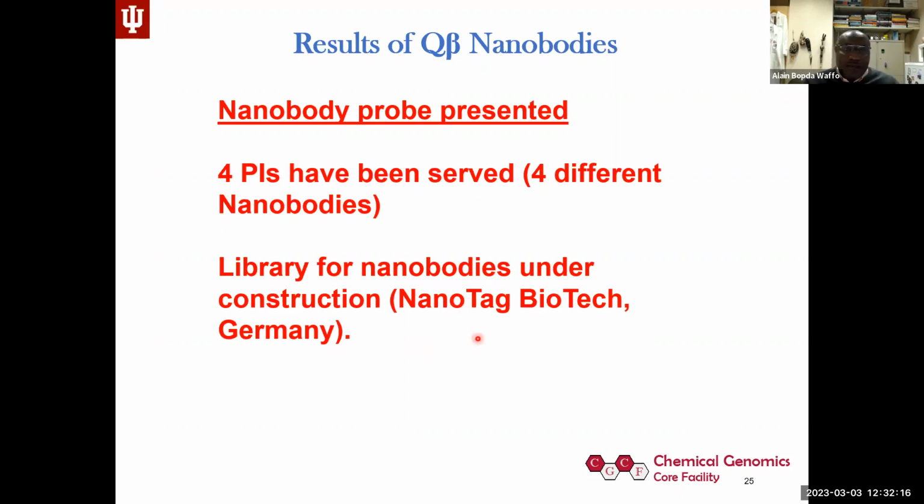Again, in the coming days, we may have this available for any selection. I'm thinking of everything, any target, even cryo-EM, if you want to crystallize some of the protein. We can see if they bind to that, what is the affinity, and then can we really use this?